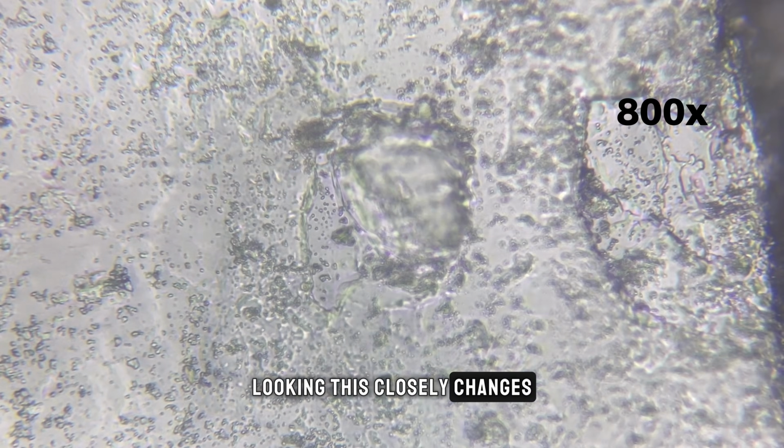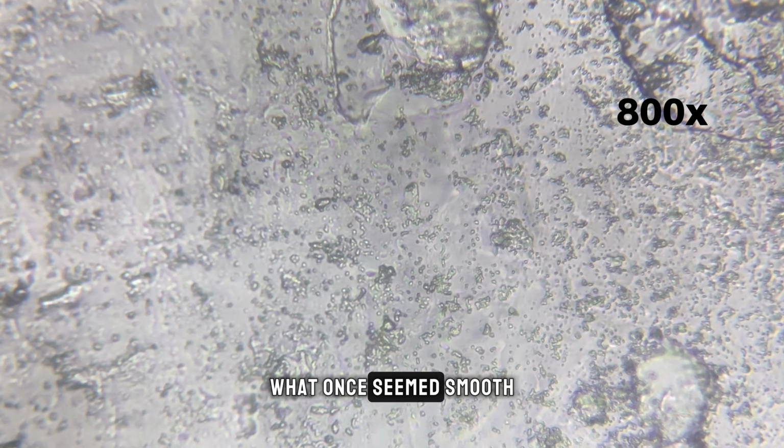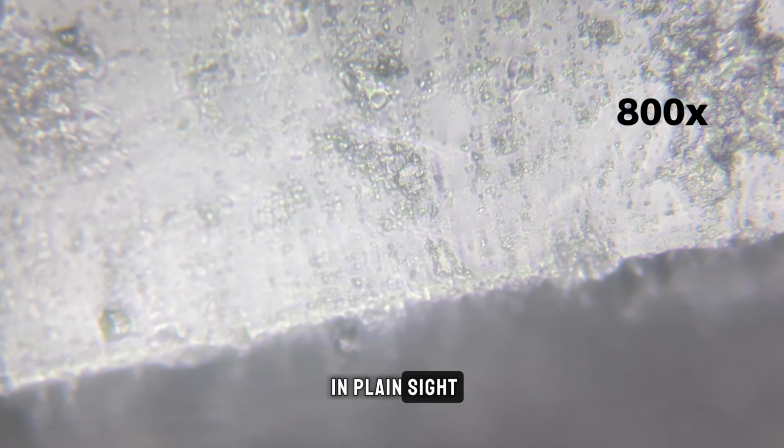Looking this closely changes how familiar sugar feels. What once seemed smooth and harmless turns into a sharp, fragile crystal world hidden in plain sight.